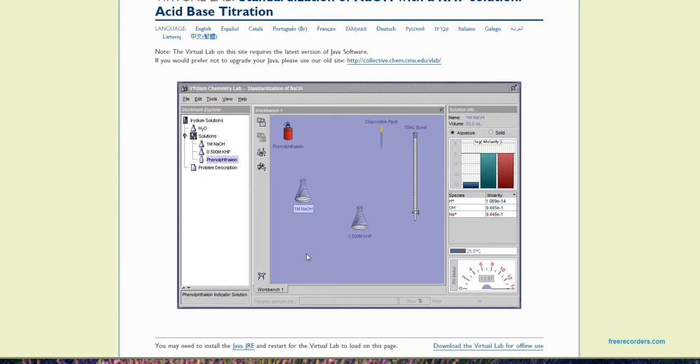Okay, now number 11, we've moved on to actually doing our titration. Your instruction number 11 says titrate small volumes, 0.5 milliliters or less of sodium hydroxide from the burette, from this thing, into the KHP flask right here. It doesn't say the flask, but that's what we want to do until a slight color change occurs. Slight color change means it's going to look a little bit pinkish.